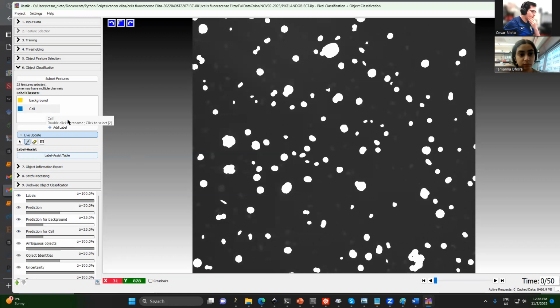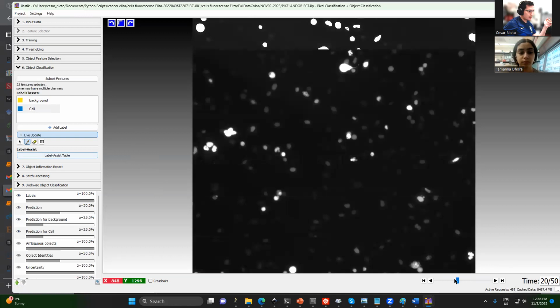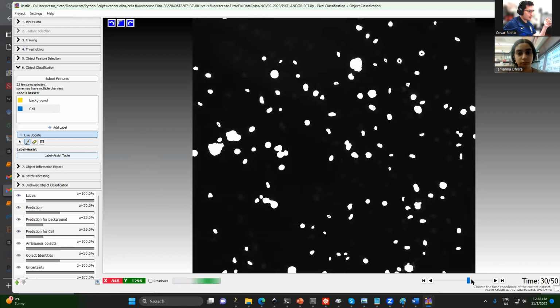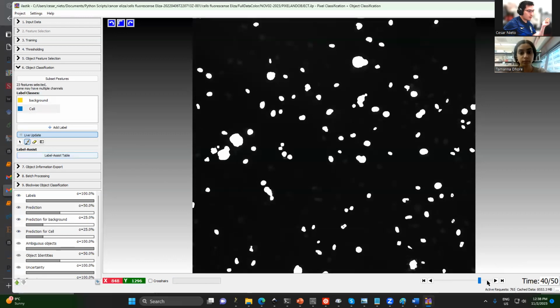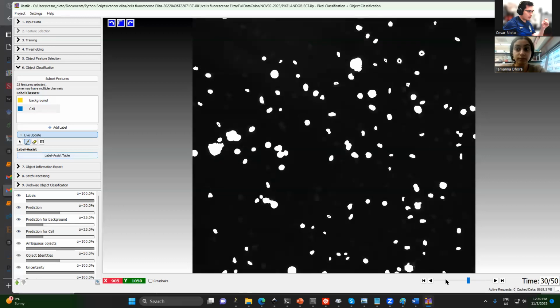here you can discard wrong cells or cells that you don't like, cells in the edge, cells that for you are not healthy, or bunches that are not cells but waste or something like that.